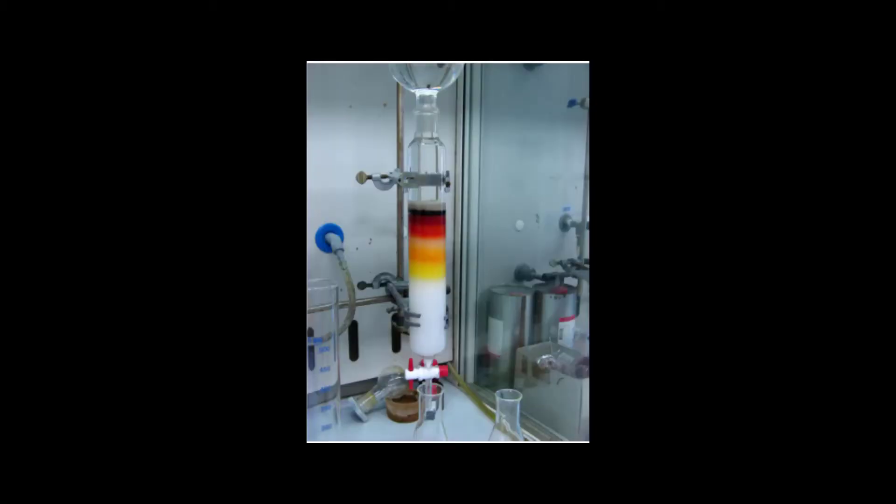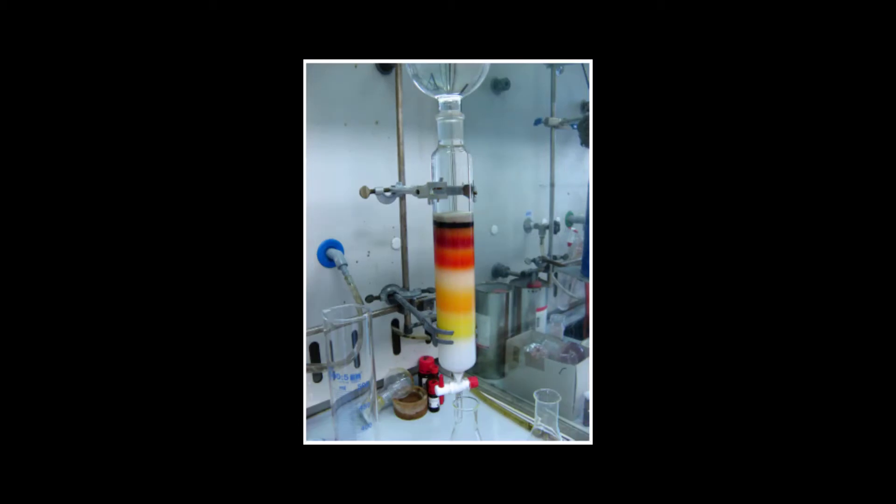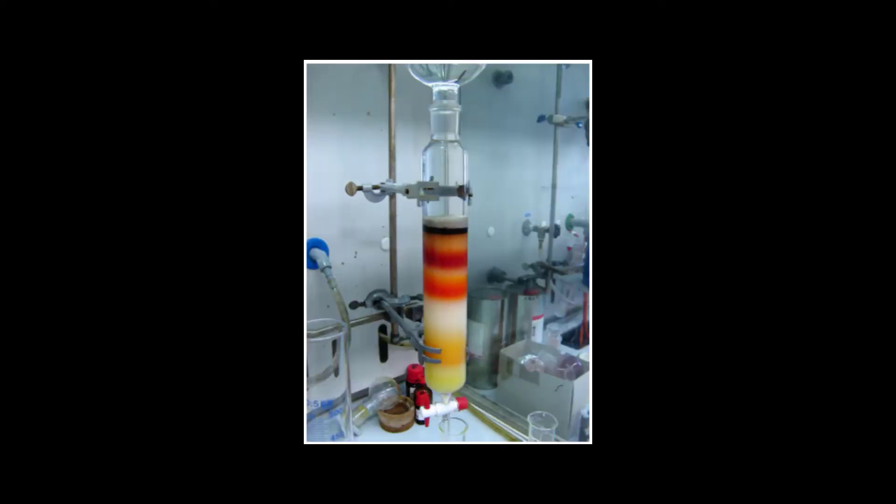In column chromatography, a glass tube is packed with a substance like silica. A mixture is placed at the top and a solvent is poured in. As the solvent moves slowly through the tube, it carries the different parts of the substance at different rates, causing the mixture to separate.